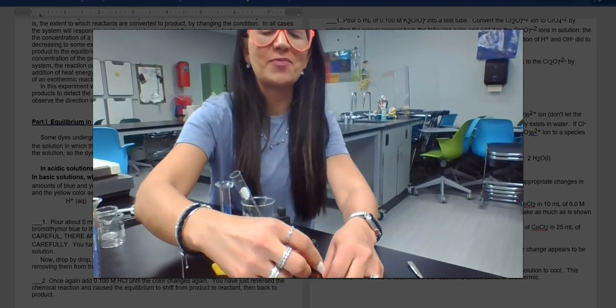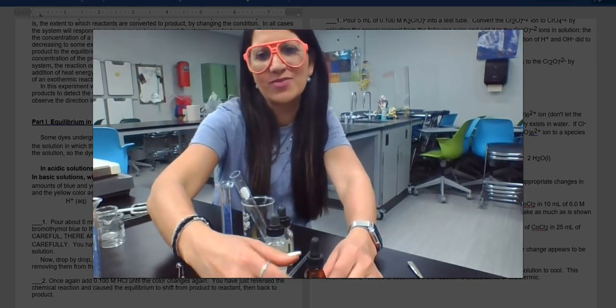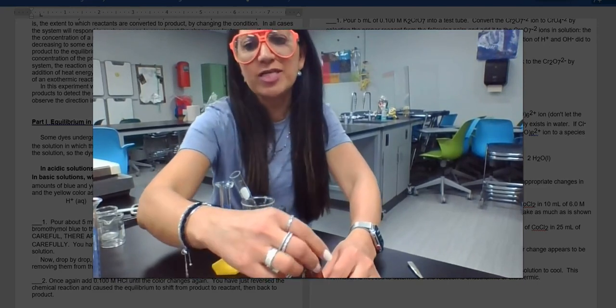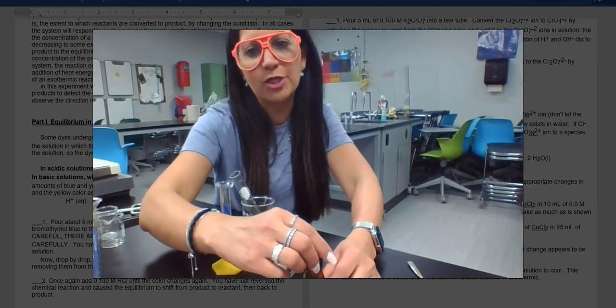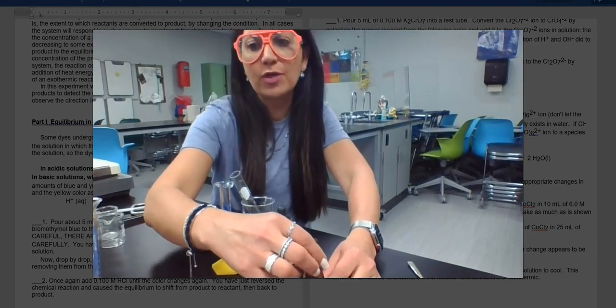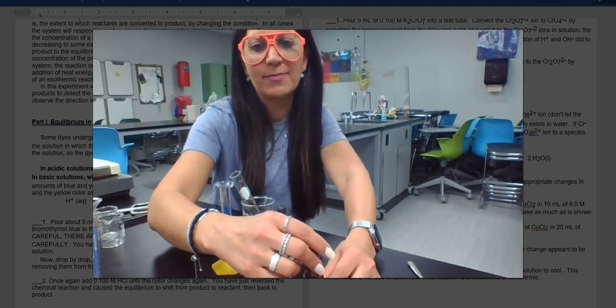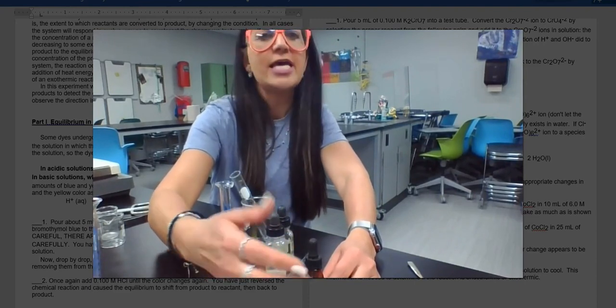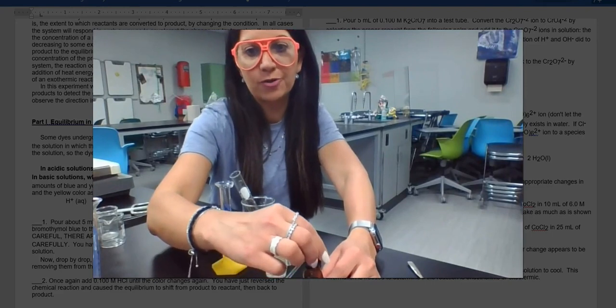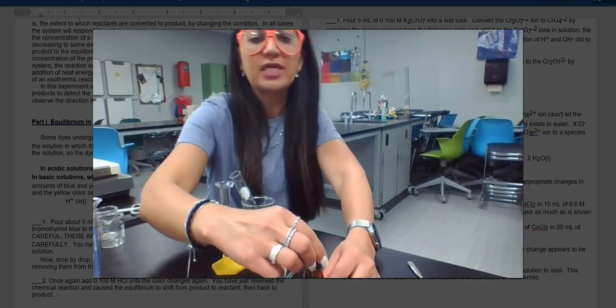So I always like to remember that a lot of times bases are blue and they both start with the letter B, so that kind of helps. At certain H+ concentrations, equal amounts of blue and yellow are present and the solution's green. Denoting the blue color as B- and the yellow color as Y, we can write the chemical equation as, and so you can see the chemical equation written under part 1 as H+ plus B-, being the blue, yields Y, the yellow.